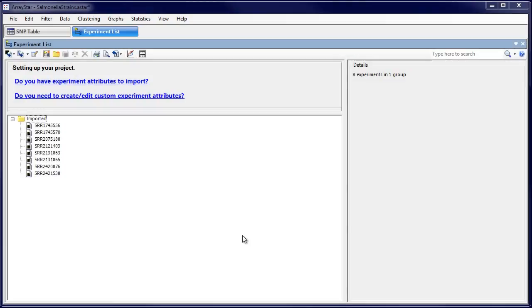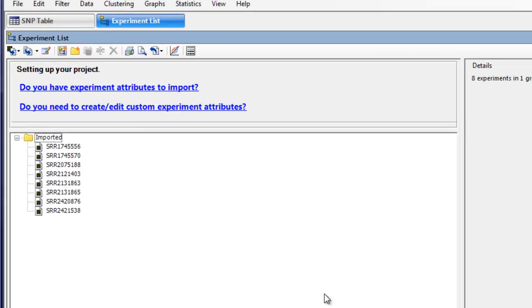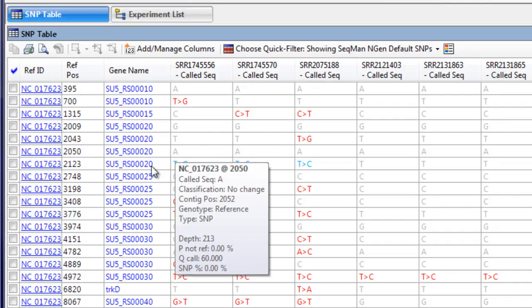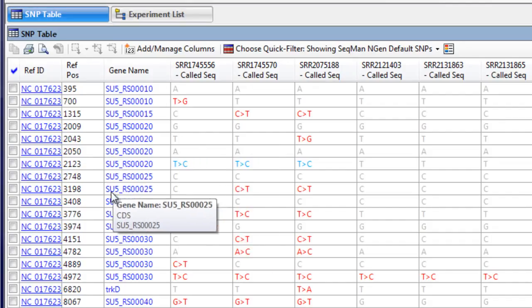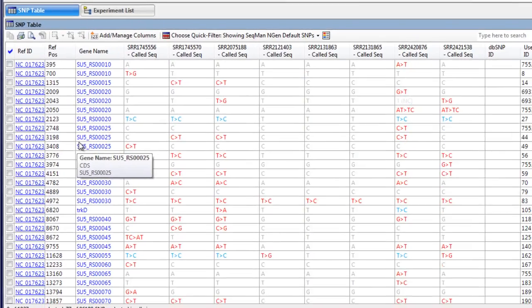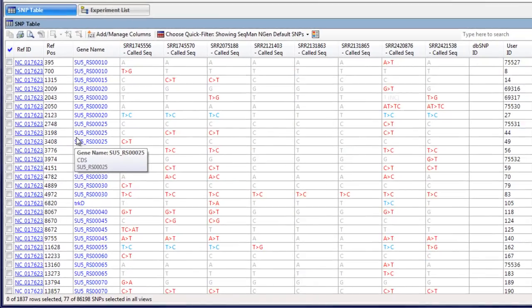Now, you can see all of the assemblies listed in the Experiment view. Open the SNP table to see the variants called at each position for all of the assembled genomes simultaneously.